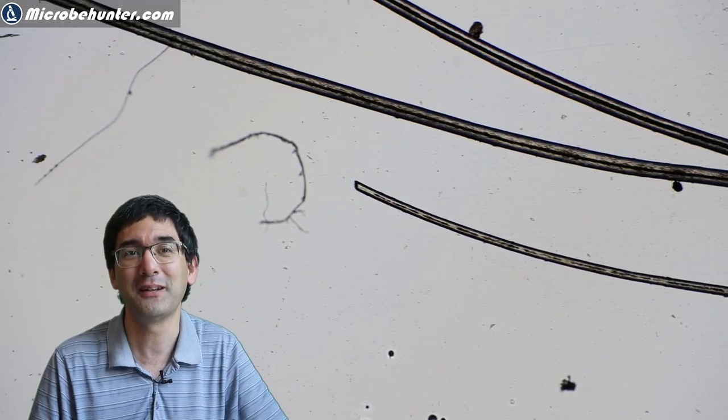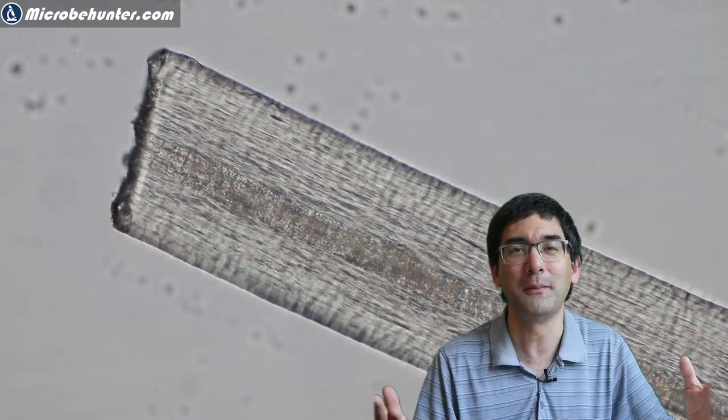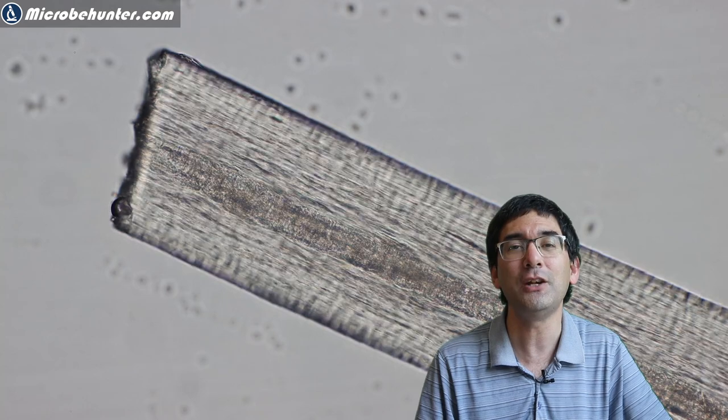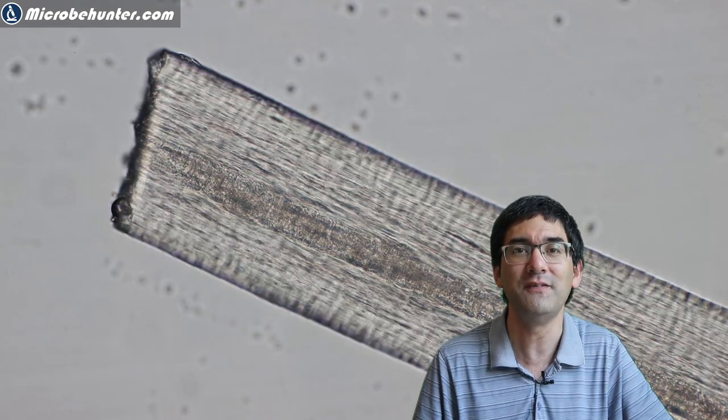That's also something that I would like to investigate. But maybe I'm investigating something that is already known. This here again is in bright field at a higher magnification, therefore the colors are not quite as nicely visible.